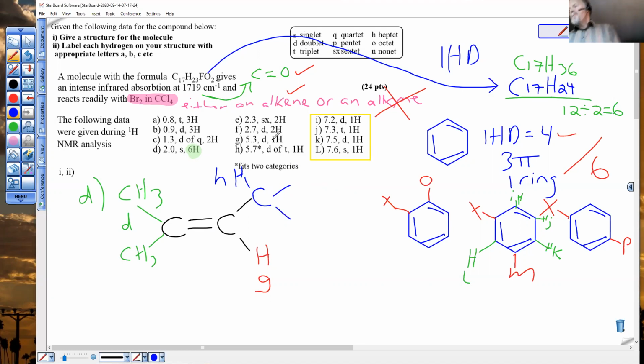And there's a reciprocal relationship here. This 1H has one neighbor, and it's G. Sorry, we're talking about this 1H having one neighbor on one side. I haven't even explained what D of T means. Some of you may have read about it. It's real useful information. Some of you would maybe prefer starting with this information. Let me break it down.